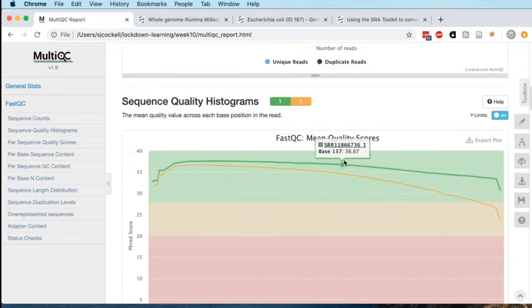Okay, our forward reads, so our first in pair reads, the _1 file has quite good quality across the board. The _2, so the second in pair reads, the quality is still pretty good in the main. It's consistently lower than in the first in pair reads, and it does drop down into this kind of orange zone towards the end of the reads. This is very typical for MiSeq sequencing. You quite often see this with the MiSeq chemistry, especially with these very long reads. So these are over 200 cycles on the sequencer for each of these reads, and the second in pair you will quite often find is slightly lower quality than the first in pair.